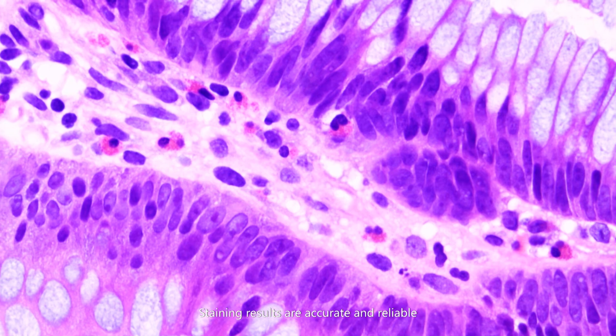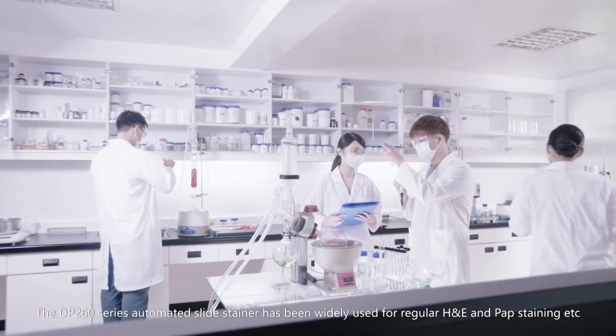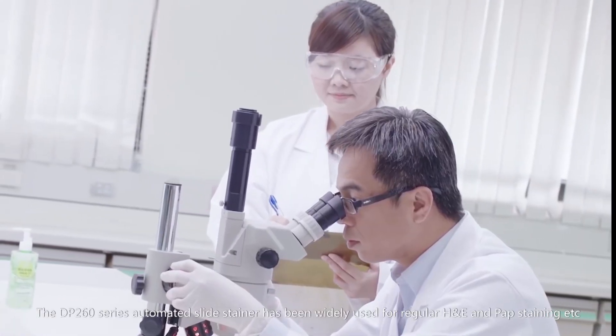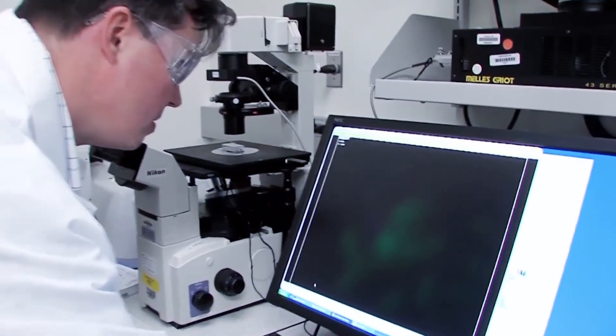Staining results are accurate and reliable. The DP-260 series automated slide stainer has been widely used for regular H&E and PAP staining.